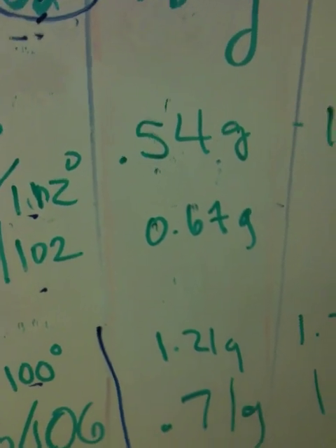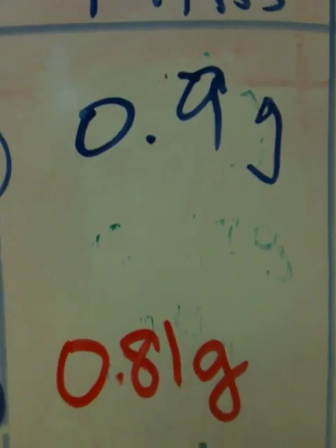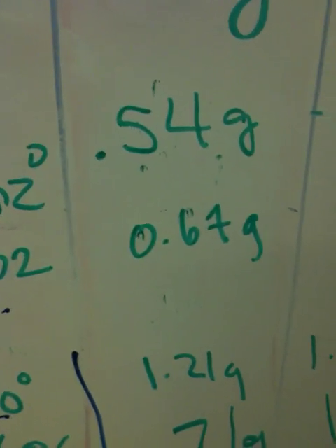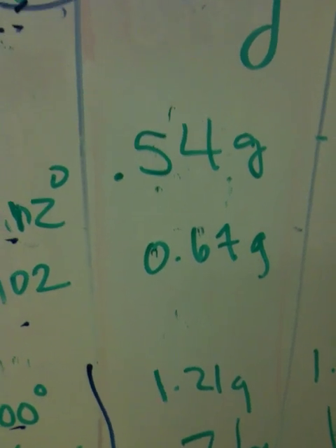And I would suggest here that a person who got only 0.54 grams out, compared with, say, someone who got 0.9 grams out, might have used a larger volume of water. Realize a larger volume of water is similar to being at an elevated temperature, in that more material will stay in solution, including the contaminant.